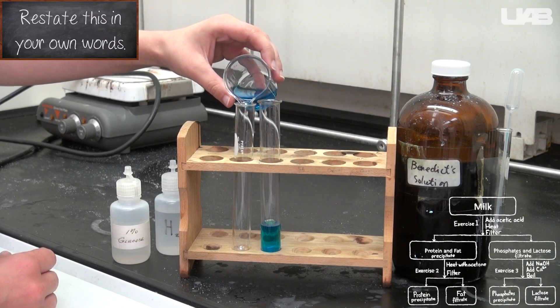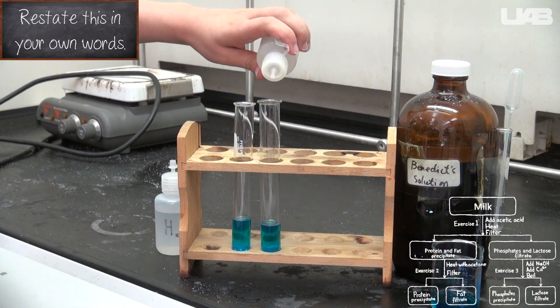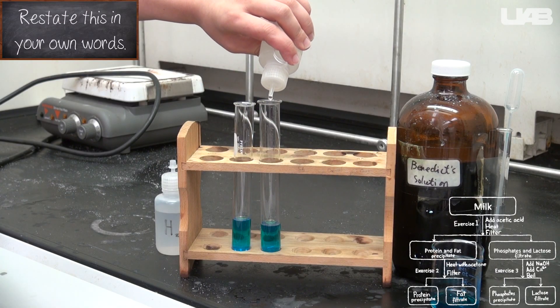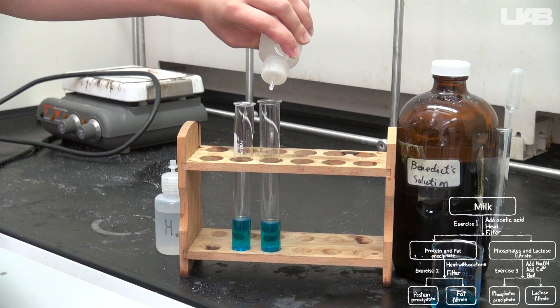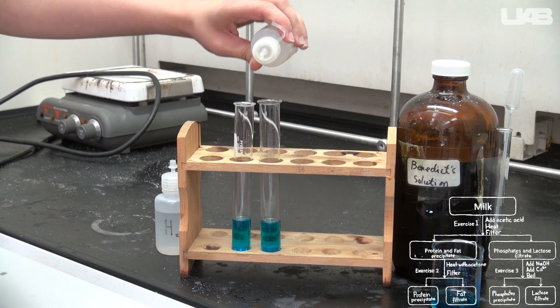One of the test tubes will act as a positive control. We will add 8 drops of a prepared 1% glucose solution to this tube. This tube will give a positive result that you can reference. Add 8 drops of your filtrate to the other test tube.